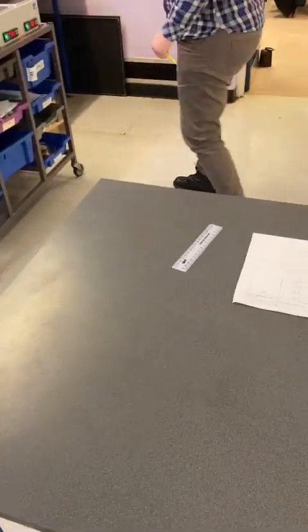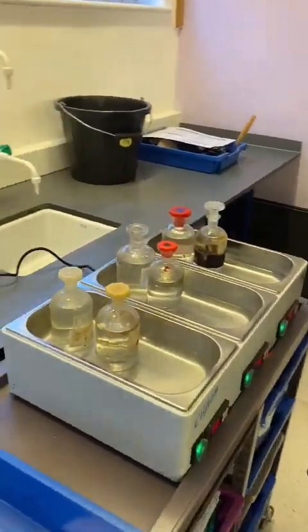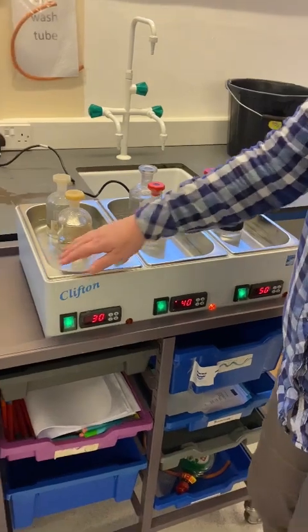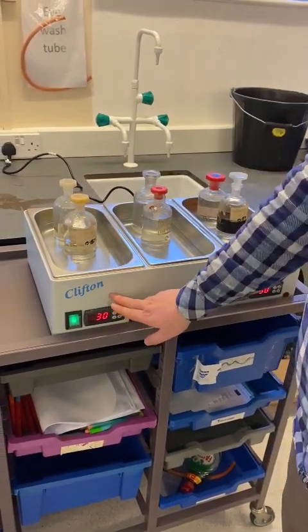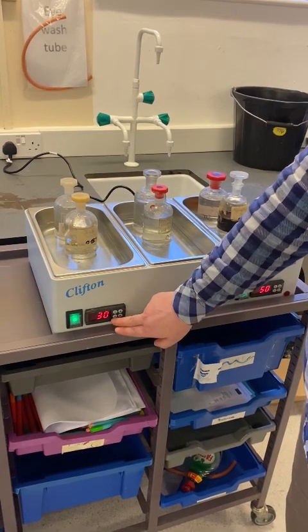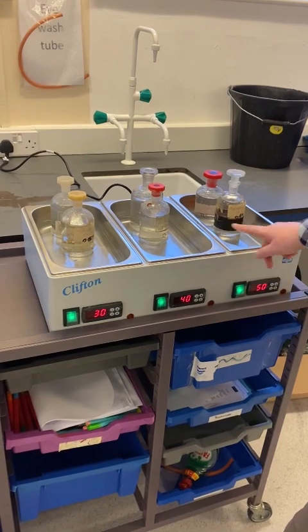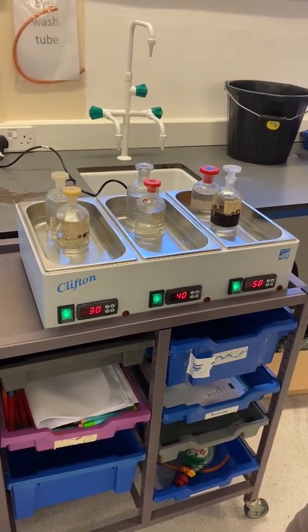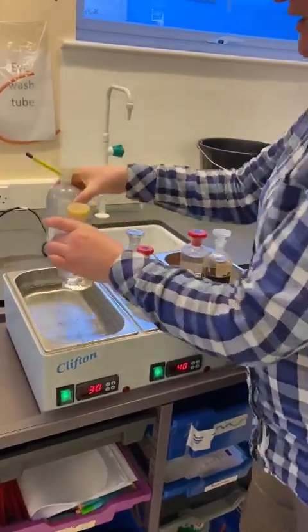Okay, so how do we get our hydrochloric acid and our sodium thiosulfate at different temperatures? We use this piece of equipment here, which has got water in here, and then there's a little heating element here, and then we can set the temperature, and it's called a water bath. So this is 30 degrees Celsius, 40 degrees Celsius, and 50 degrees Celsius. So I'm going to take out my sodium thiosulfate and my hydrochloric acid.